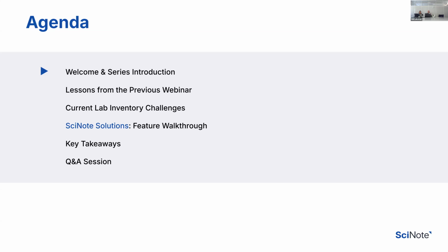We're going to start today with just lessons from the previous webinar to make sure that we are on the same page. Then we're going to tackle the challenges. So some of the challenges all of you mentioned previously, we're going to try to see if any new challenges came up. So there's going to be some polls. Then we're going to do feature walkthroughs. So what are some of the things SciNote can do? And we're going to map them to the challenges you mentioned. Finish off with key takeaways. So what we want you to take from this webinar besides seeing our features. And then we're going to open the stage for a Q&A session.